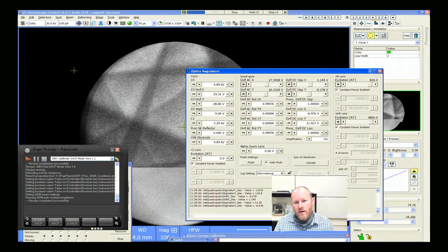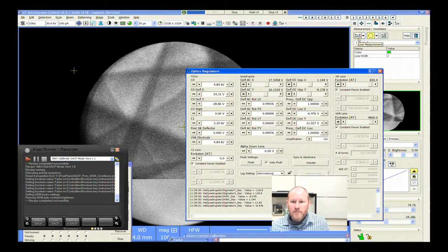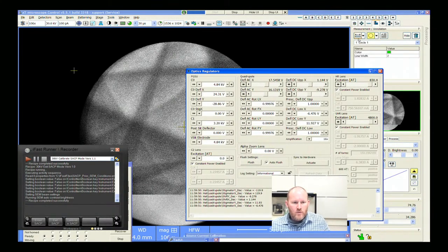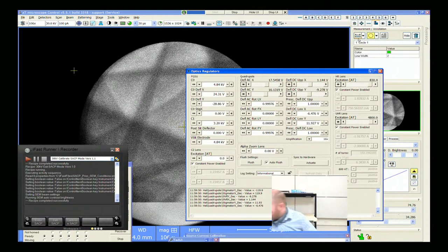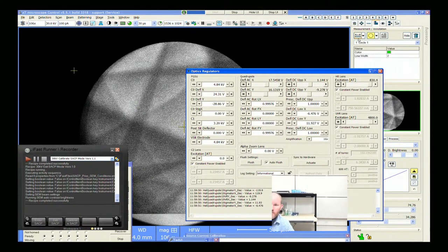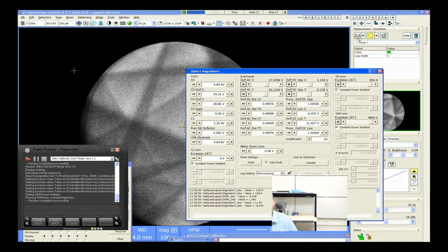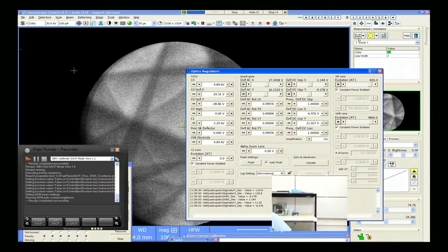Our values have changed here just a little bit — deflection AC is now 17.5.